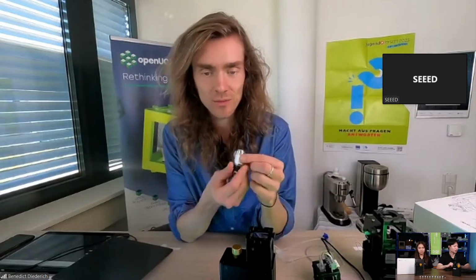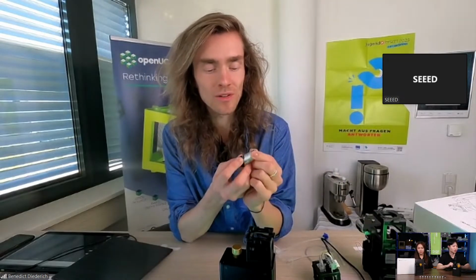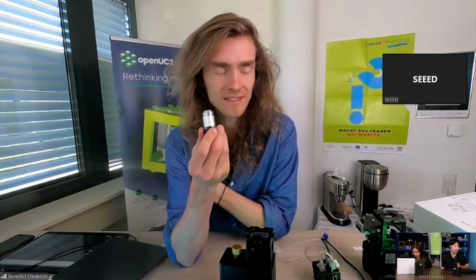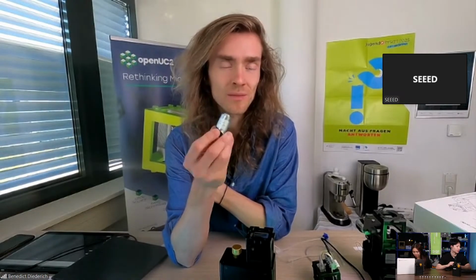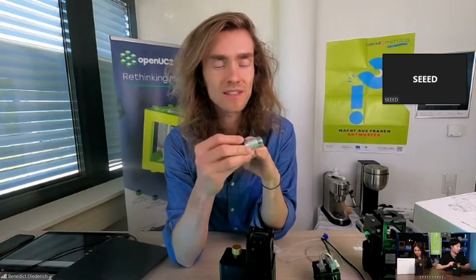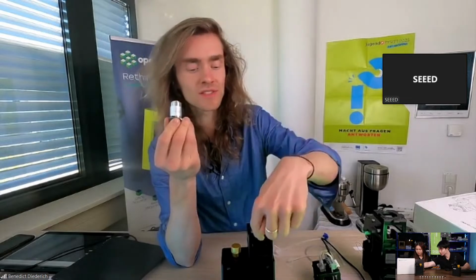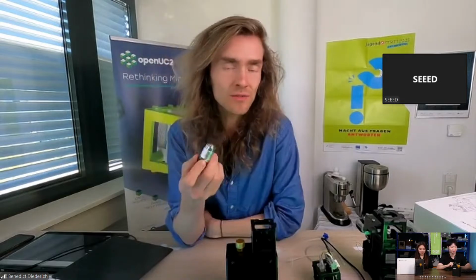The zoom option. Well, with these lenses here, it's a bit like a fixed focus lens from your photo camera. It doesn't really have a focal length as you would have from your photo camera, but it has a magnification. This is a 60x lens. What you essentially do is you magnify whatever is in the sample plane onto the camera plane by a factor of roughly 60. And then you have to see what's the resolution on the camera pixel size.